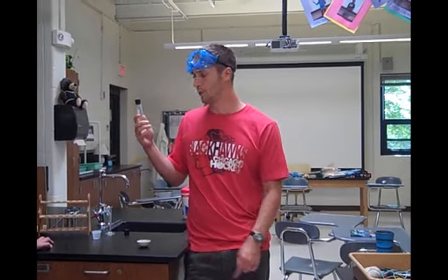As I'm shaking my solution, I'm holding the bottom of the test tube just to heat it up a little bit to dissolve more of the solute. Now that we've been shaking for 3 minutes, we're going to pour just the solution into the evaporating dish. We're going to leave any undissolved solid at the bottom of the test tube. So it's important that you're only pouring solution, not undissolved solid.